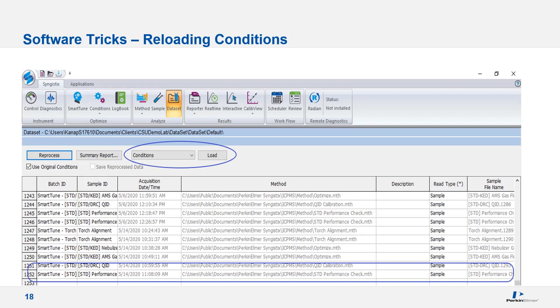Now I'd like to touch on a few tricks within our software that could be helpful to you. Many labs try to tune their ICP-MS and cannot understand why any tuning they do is not working. My starting point is to go back to the last time the instrument was running well and reload conditions from their default dataset. Once this is done and saved, start a smart tune. In many instances, this can resolve tuning issues for many customers. The same approach can work for the mass calibration or dual detector calibration as well.